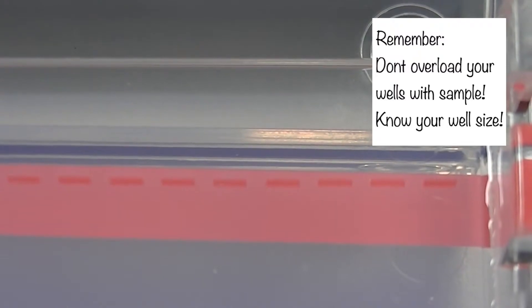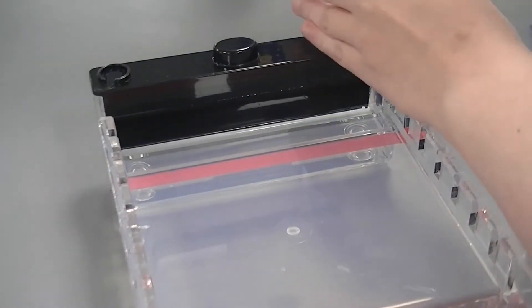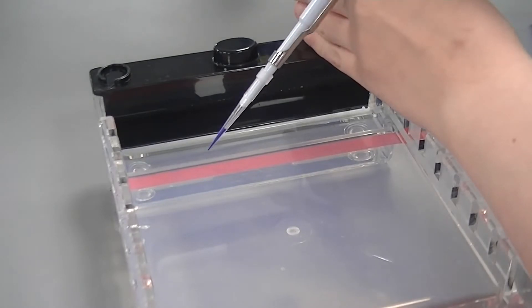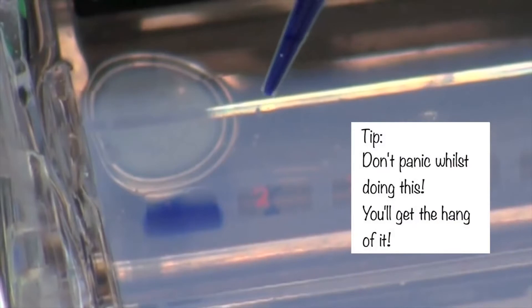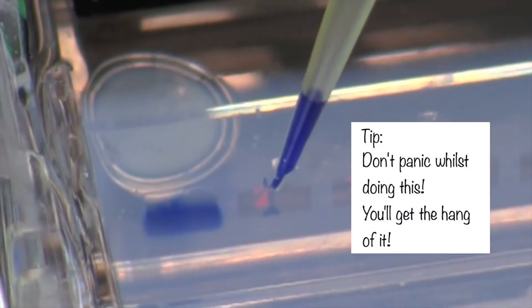Before loading your sample, ensure you have a comfortable hand position and steady hand. When loading your sample, place the tip of the pipette into a well and slowly eject your sample. The glycerol in your loading dye means the sample will sink to the bottom of the well.